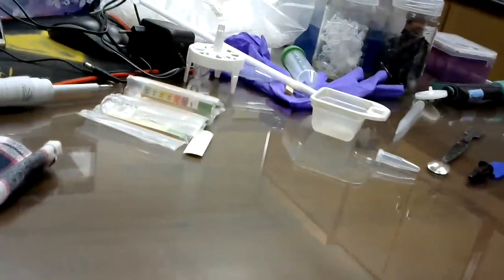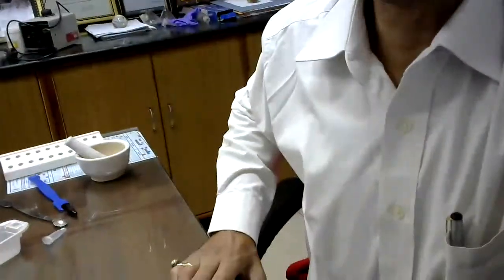So whenever you are working in the laboratory, okay, let me put the camera here, you must use an apron, that I might have told earlier, and then you need to wear gloves according to the requirements of whatever experiment you are doing. But an apron is a must. You should always wear an apron to protect your clothing. And sometimes if you are working with UV light, then goggles should be there to protect your eyes from UV light.